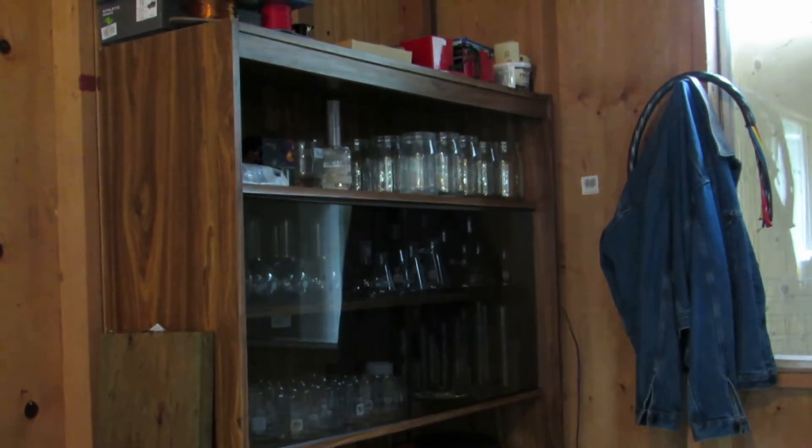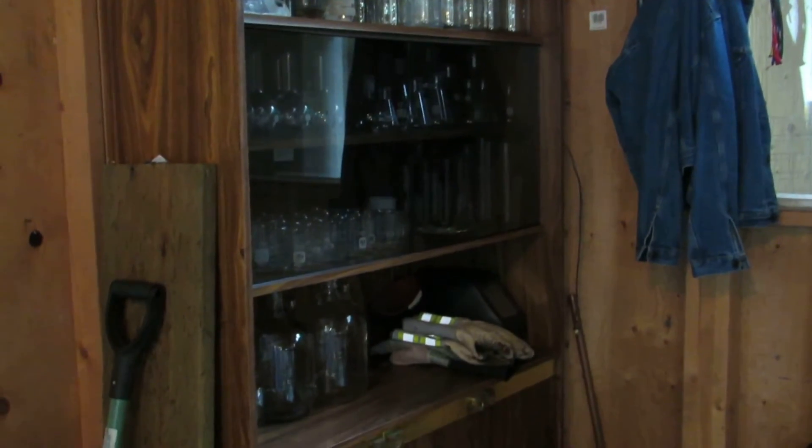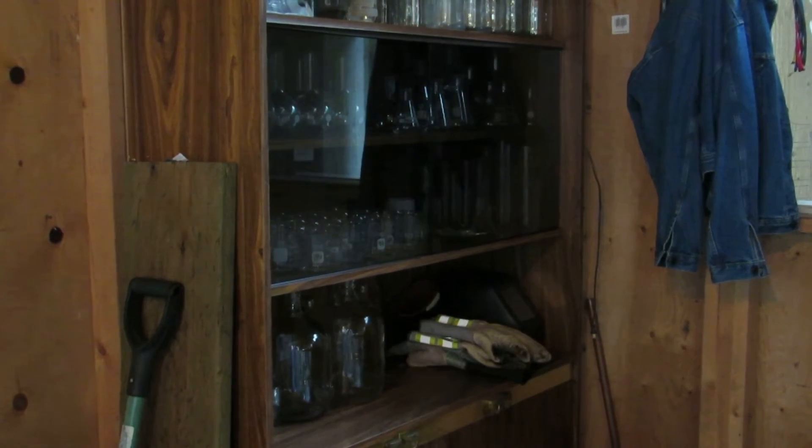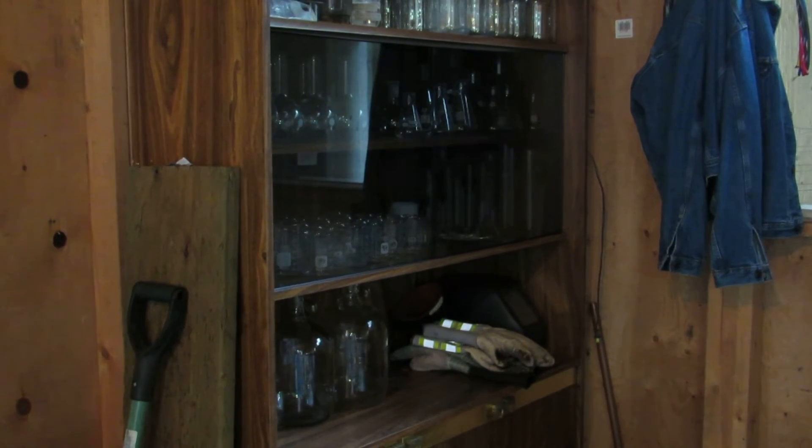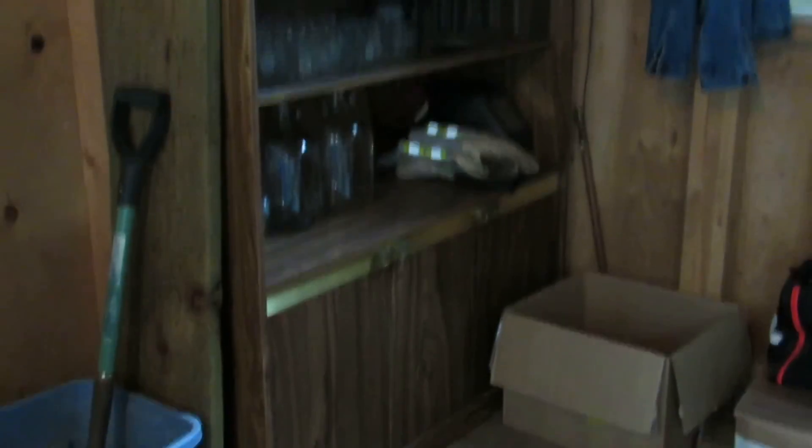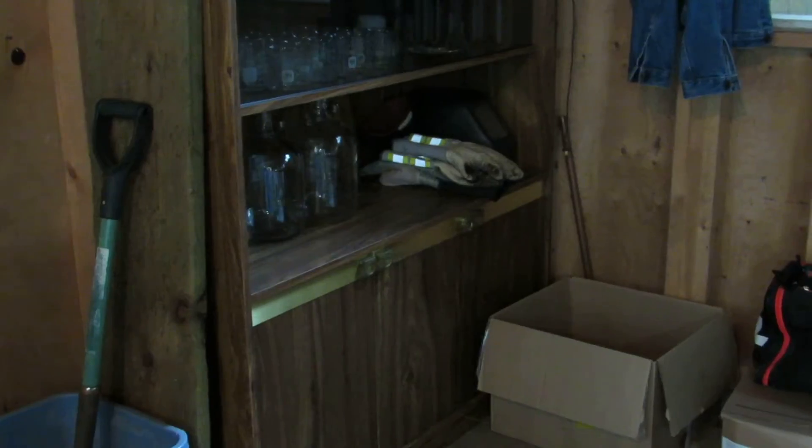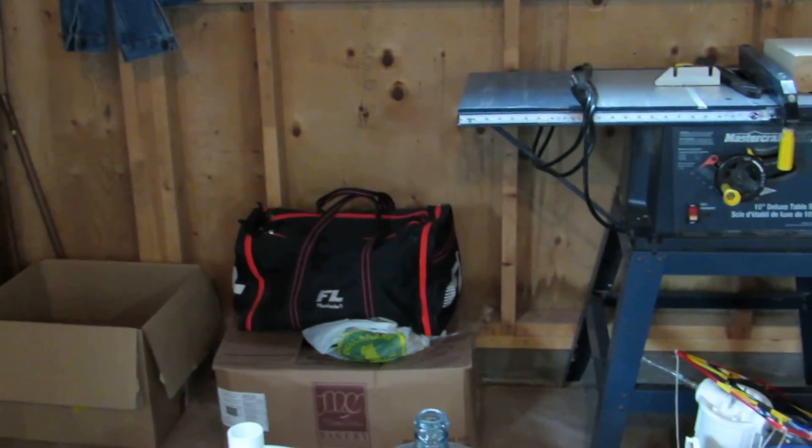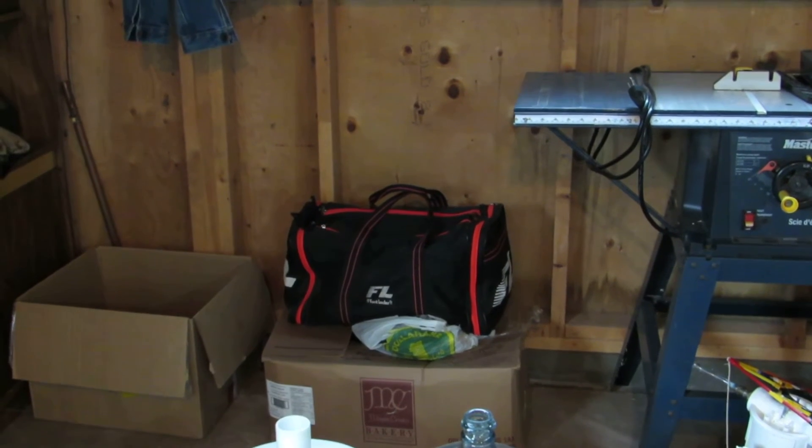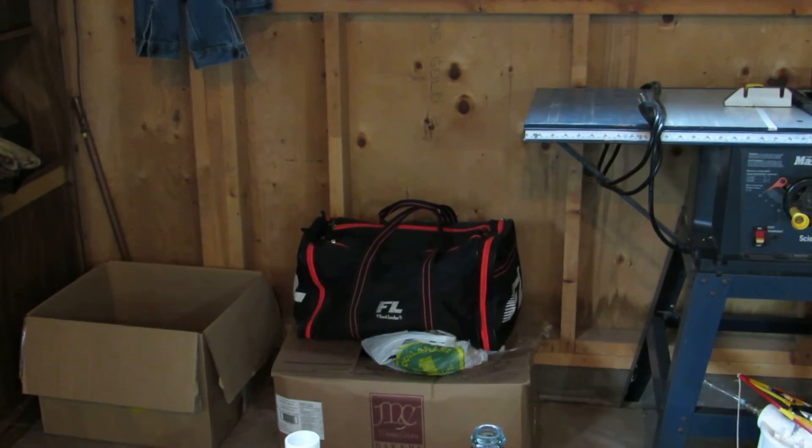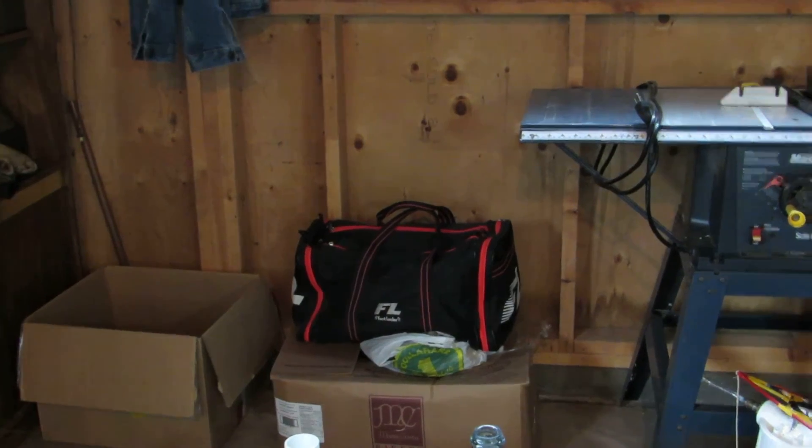Over here I have a whole bunch of my beakers and jars and glassware there. Everything that's not in a box is essentially over there. And those are just nice and convenient to grab whenever I need them because beakers are used fairly frequently. I also have other things on top and my welding mask and gloves over there. Some tools in the back. Another big box of junk underneath all that. Those are just random projects. Just a bunch of stuff that I think might be useful one day.